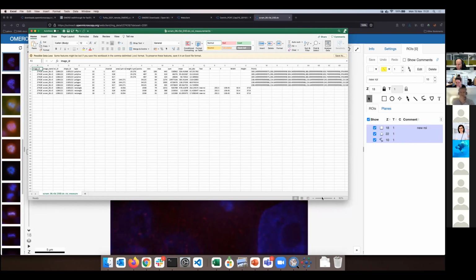So just for you, Mayank, that image is not locally in my office on the Mac I'm working on. It is simply not there. I've done the analysis remotely. The image is still sitting remote. I didn't have to drag it down through the thicket of internet, okay? I just viewed the correct plane. I draw my regions of interest and I am having the analysis here. In a very similar manner, it will be shown tomorrow how to use Omero when you are using Fiji or QuPath. That's similar, okay? You drag through the internet only what you need.